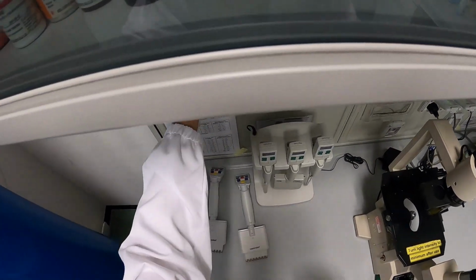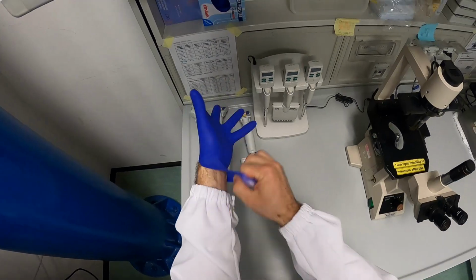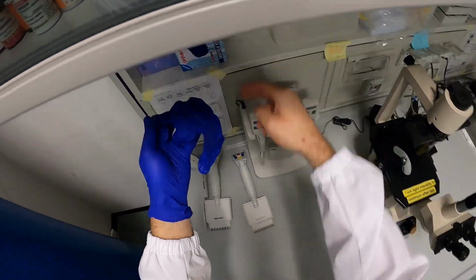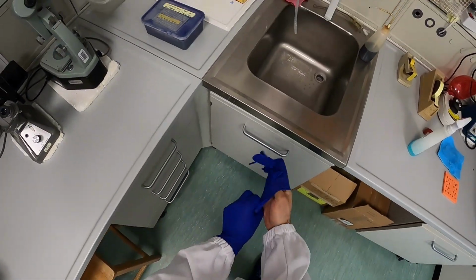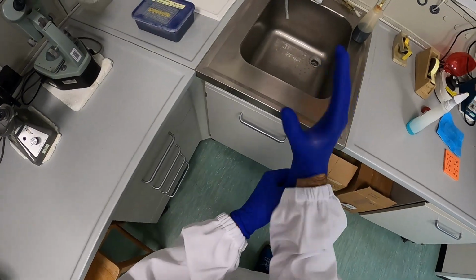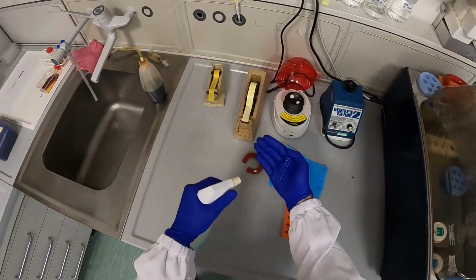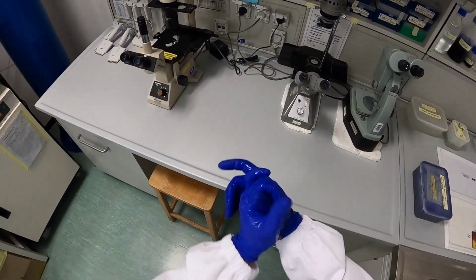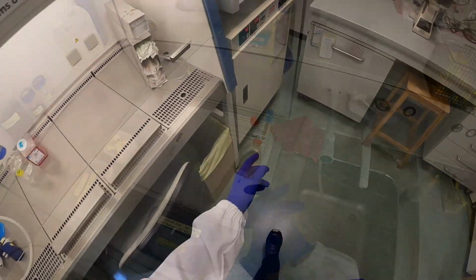Okay, so everything is ready. You're ready to take the cells out of the incubator, so put on some gloves, and please remember these gloves are not sterile and they're really there just to protect you from the experiment. They won't avoid you getting your cells contaminated if you're not working in the right way. You can spray them down with ethanol, but it's just a layer of protection for you.